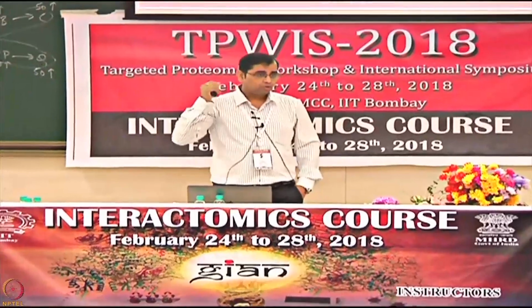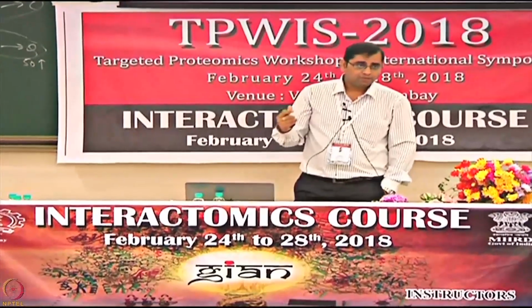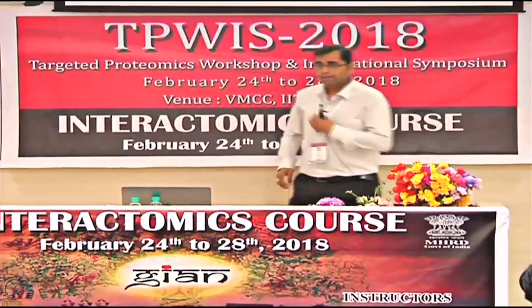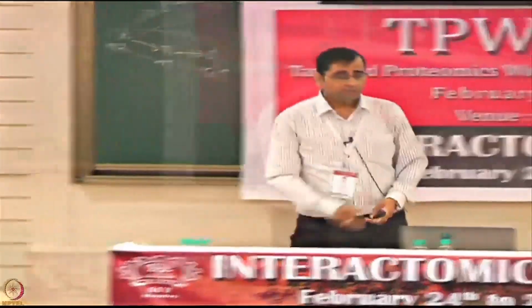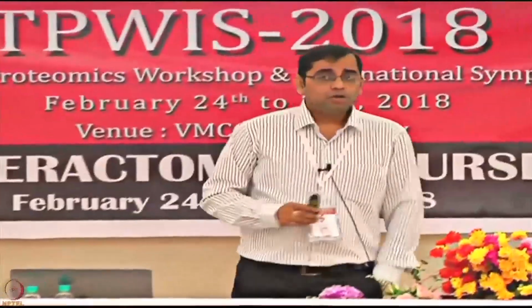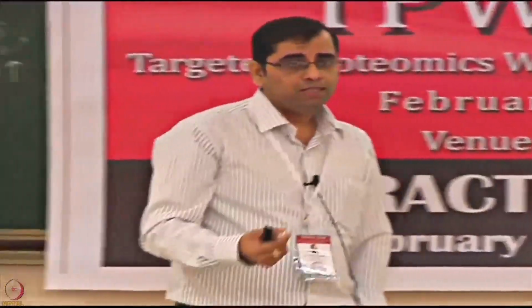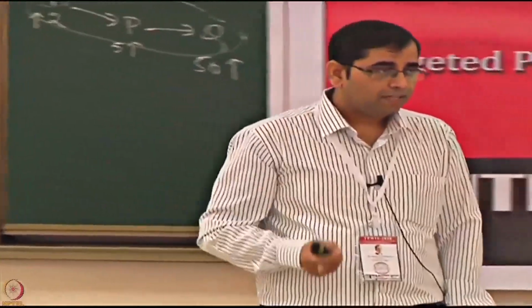So many of these technologies are still at the proof of concept level, which needs to show what could be done at the actual biological sample level. Therefore, what I have shown here, not everything has reached the biological lab, and not everything is actually holding up to the biological experiment, because biological samples have a lot of low abundant proteins. You will not have that strong an analyte to test out.